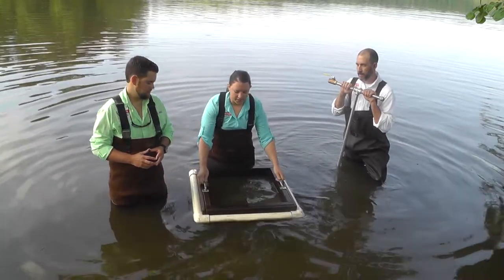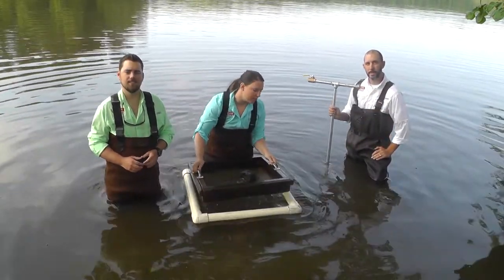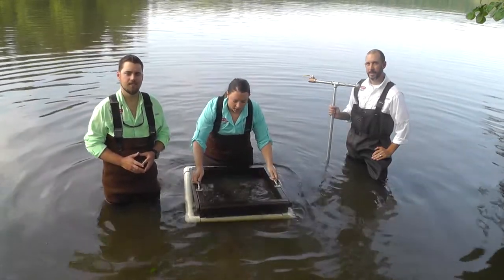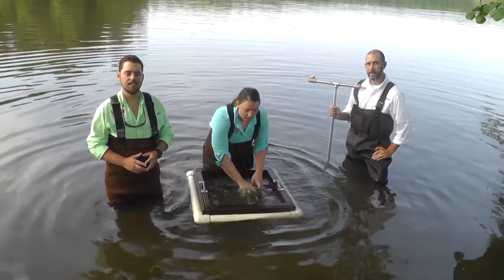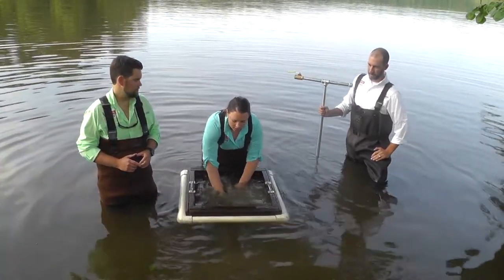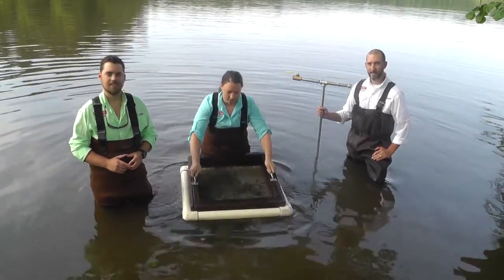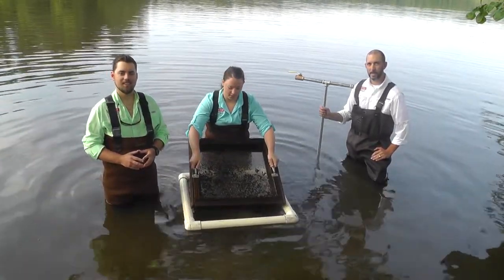Here I have a sieve with one-eighth of an inch mesh. It is placed on a PVC float. You can then shake around the sieve and get your hands in the sediment and work it through the mesh to get out all your fine particulate matter, and then you can look at what's left and pick out your tubers.